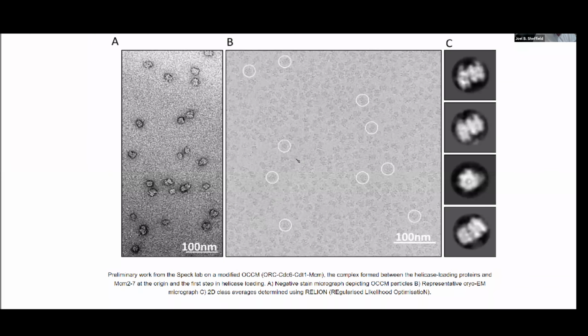So here's an example. I'll give you a couple as we go along. Here's an example of what a field like that might look like. If you used conventional negative staining, which remember we've discussed a little bit as a technique for the TEM, you might be able to see something like these. But remember what these are is, here's your protein sample, let's say, and what is around the sample turns out to be this complicated array of negative stain.